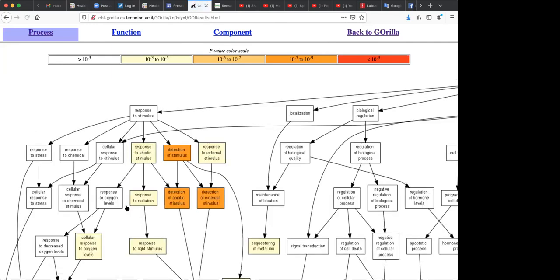Okay, so this is how you do it. So please do it by yourself now. I will give you 10 minutes to run, but separately run it for the upregulated and separately for the downregulated. And when you do it, we will go over the results together, how to interpret what we should get and so on. So take your time now. I will pause the recording now and you will do it. Let me know if you have any troubles and I will help you.